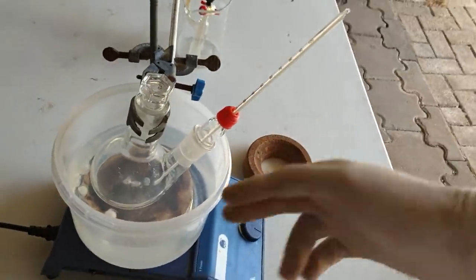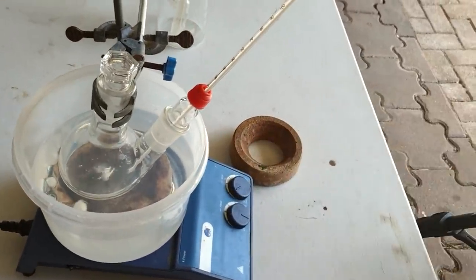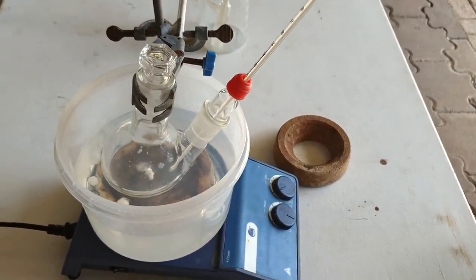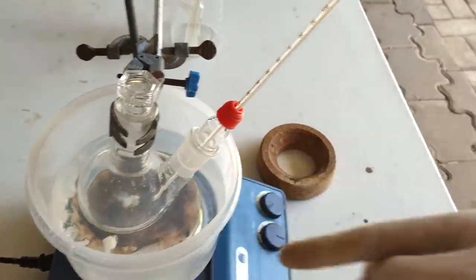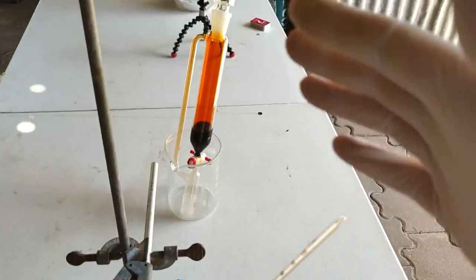Also, light coming in, you know, using bromine tends to have some reaction with UV. I think that's a little bit overdone, but I will try to protect this from the light, just so that we negate that possibility from ruining our yields. Because if we get a shit yield, everyone will comment, oh, it's because of the UV, the sun was coming in. And yes, we will try and block it out. Not for the moment, because I don't want to use alfoil and bromine at the same time.